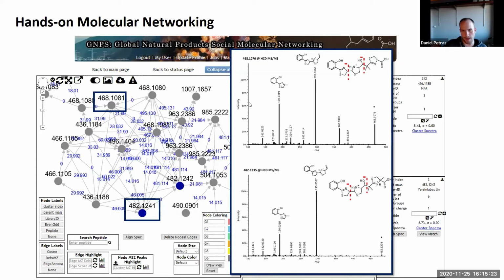And then for yersiniabactin, as we know already the structure, we can start hypothesizing potential fragmentation mechanisms. And most of those fragments I could explain here with certain bond breakages. So if you throw this molecule into ChemDraw, you can start drawing lines in there and calculate what the weight of those fragments would be. And then what you will find out for this example is that most of the fragments we could explain here on that C-terminal, N-terminal part are actually constant.